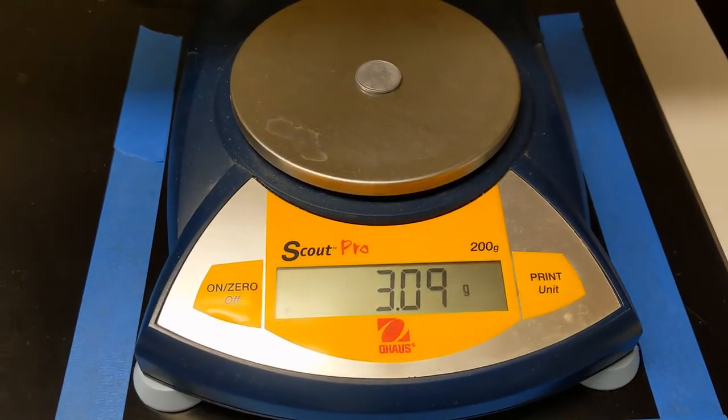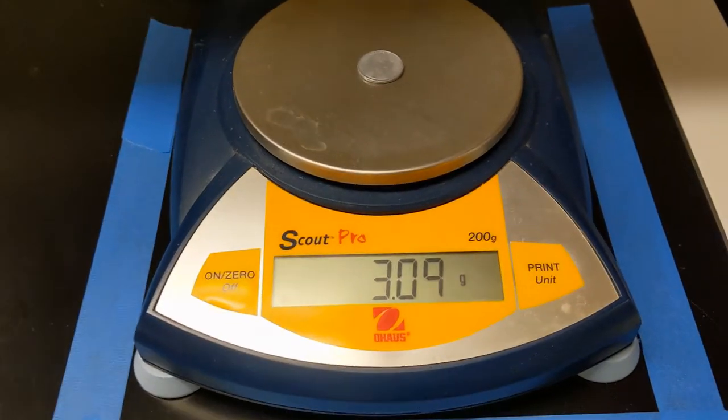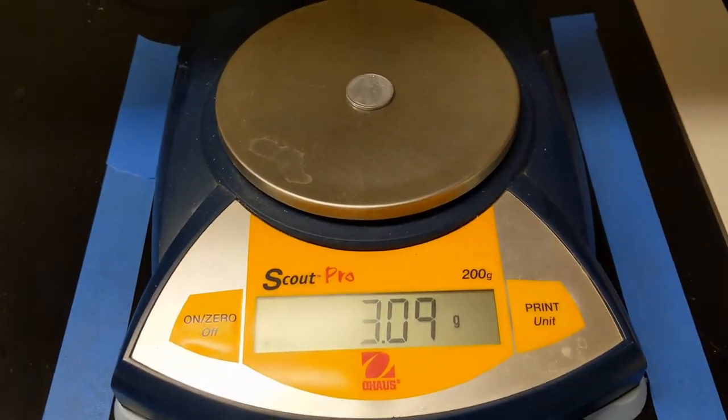3.09 grams. So this is for our 1975 penny. Be sure to write that down. That is 3.09 grams. All right, taking this one off.